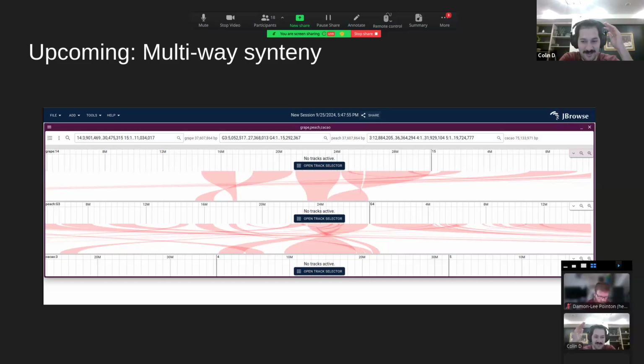And it's just something that we overlooked, and it'll be like, oh, we're doing an O of n cubed thing when we shouldn't do that. So if you have an example of this, I would love to see it. There was a recent one where we did find a very silly thing that was slowing it down for large numbers of contigs, and we made a fix for that. That was probably only within the last 2 months or so.